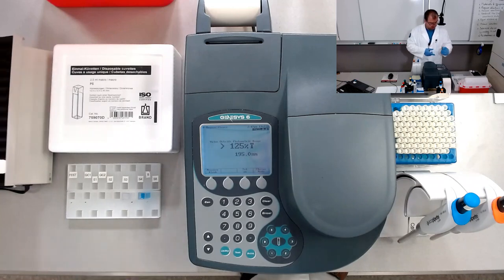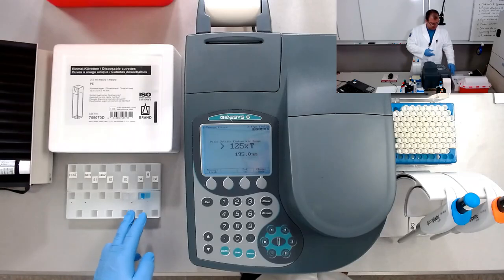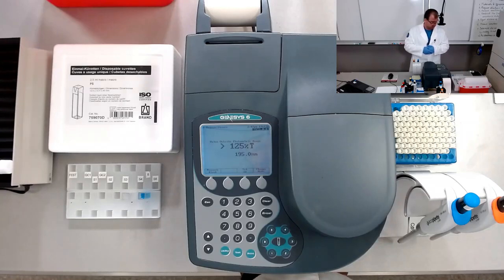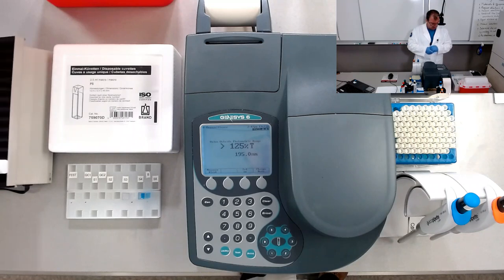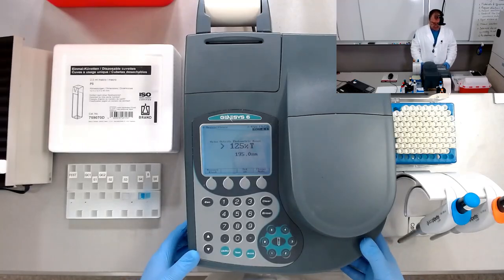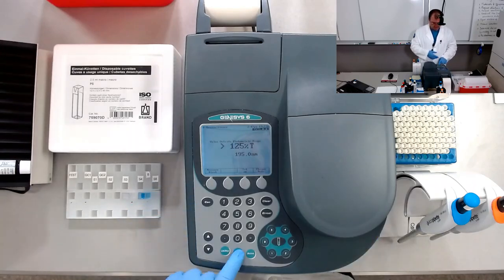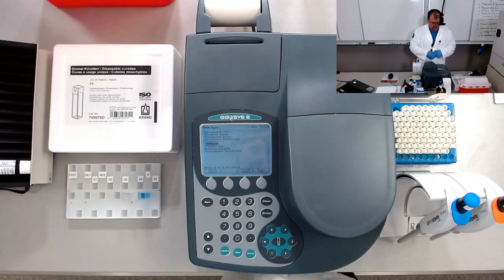So two cuvettes. The first one will be the reference, the blank. We use it to blank the instrument to get the I0. Remember, the incident radiation intensity. The second cuvette contains total protein reagent. We have the spectrophotometer here. We left it to warm up, and now let's go and find the scanning. In the scanning test, we are going to get the absorption spectrum.